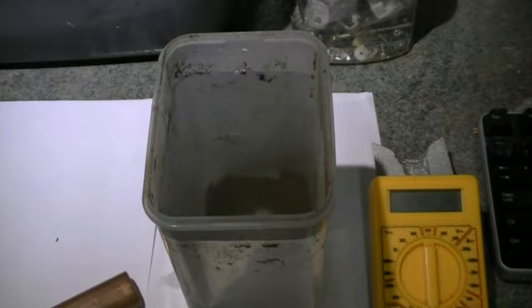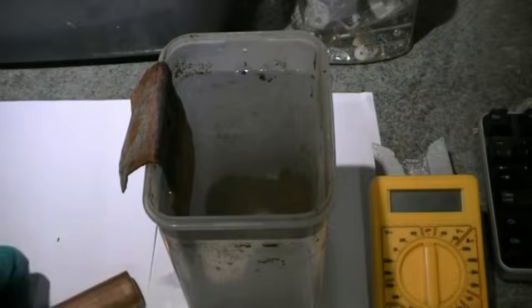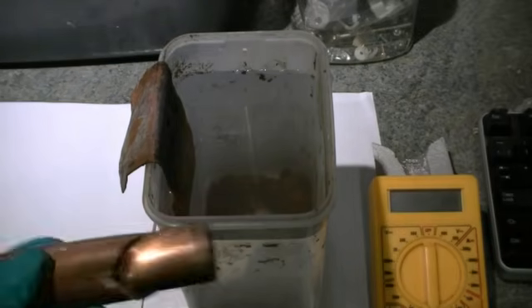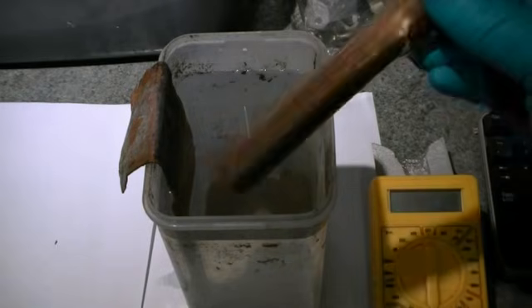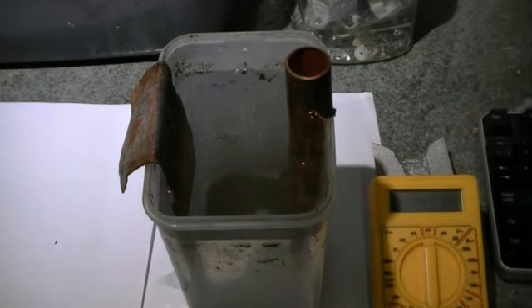Our electrodes are from some copper water pipe. We've split the cathode down the length and opened it up, and the anode we've cut a notch in the side to help rest on the side of the container. With our copper electrodes partly submerged, the next step is to hook up our DC power supply.